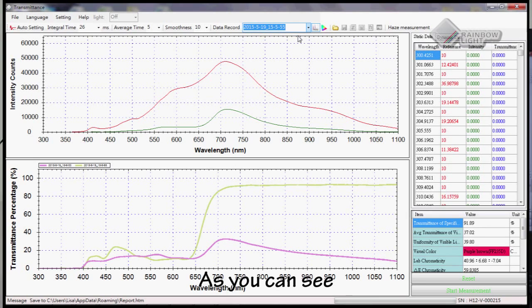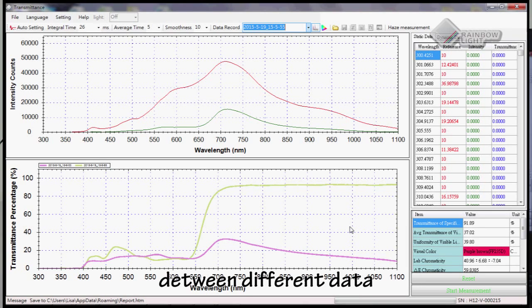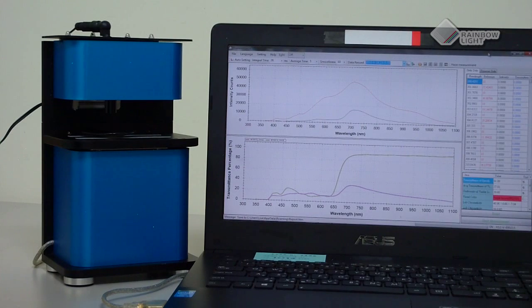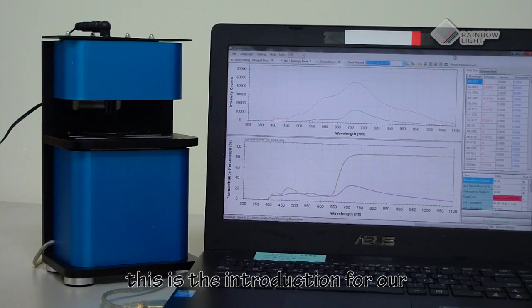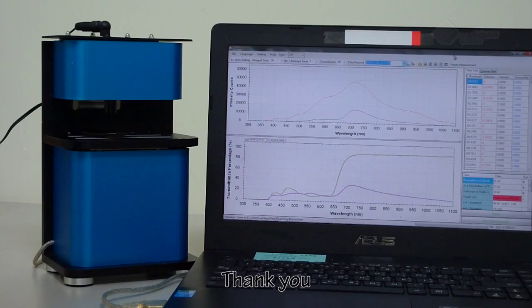As you can see, here we show you the difference between different data. This is the introduction for our full-spectrum transmittance measuring equipment. Thank you.